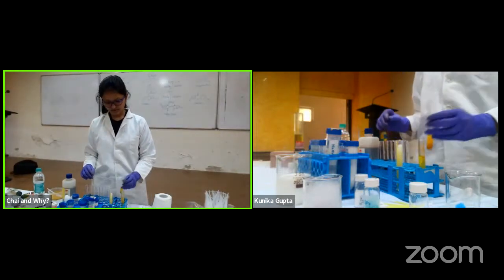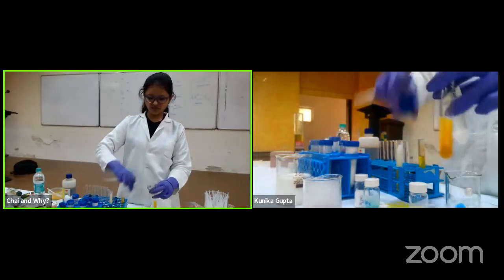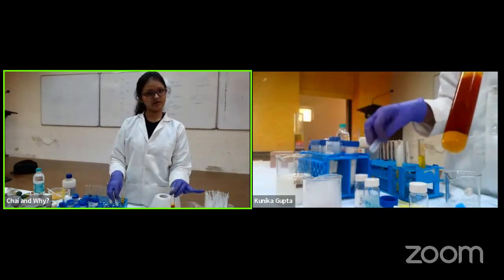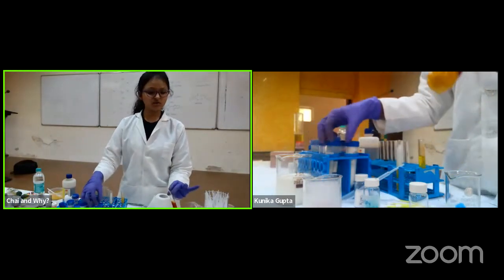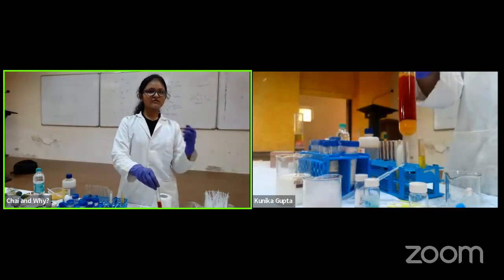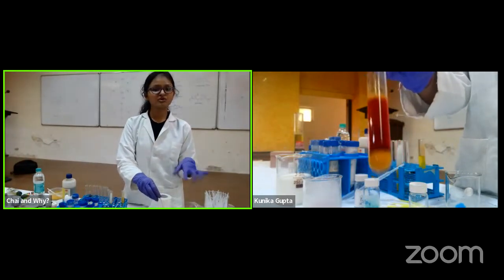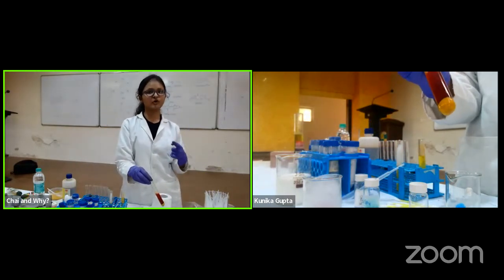Okay. So first, let me show you with a lab chemical. Then I'll make a detergent solution and show you with that. You see a color change, right? Right there. So it has turned to red. So this thing you would have observed very easily. You might have ignored it. When there is a haldi stain on your t-shirt or something, and you wash it with a soap, it immediately turns red. So this is how haldi can actually act as an indicator.